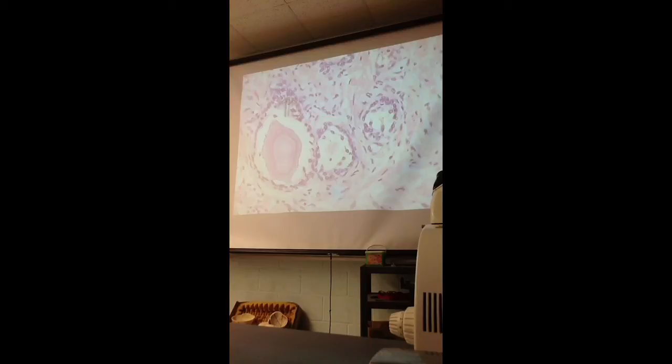But when you look at this structure inside the gland, it is called corpora amylacea. This is actually the dried up secretions of the prostate that have been impregnated with calcium. Because this process occurs over a period of time, you can see layering of these secretions, just like onion rings.